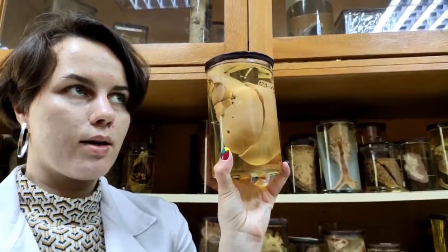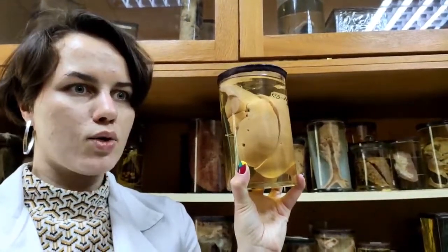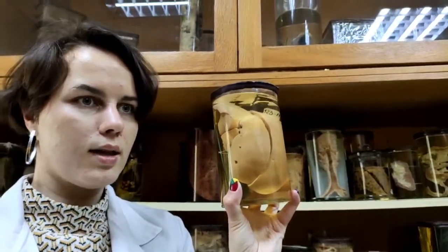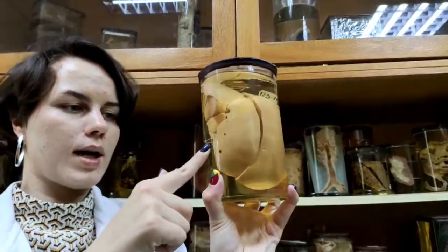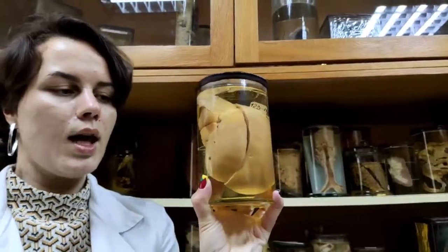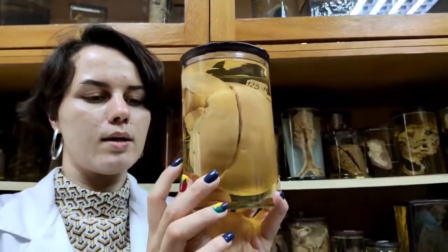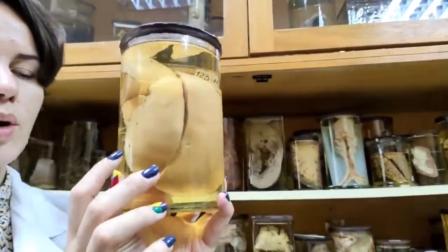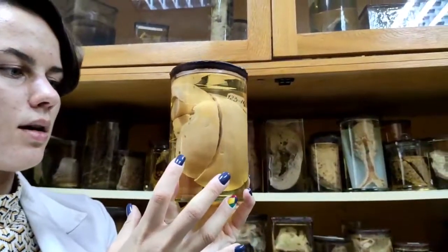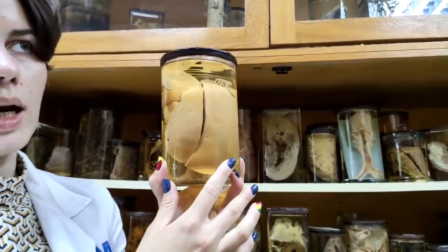This is when the liver of ducks or some house birds, when they are fed a lot, becomes like this, and people then eat these livers. In people it's quite similar. When a lot of fat accumulates in the liver, we call it steatosis. You can see that the liver is enlarged and has a diffuse yellow color.